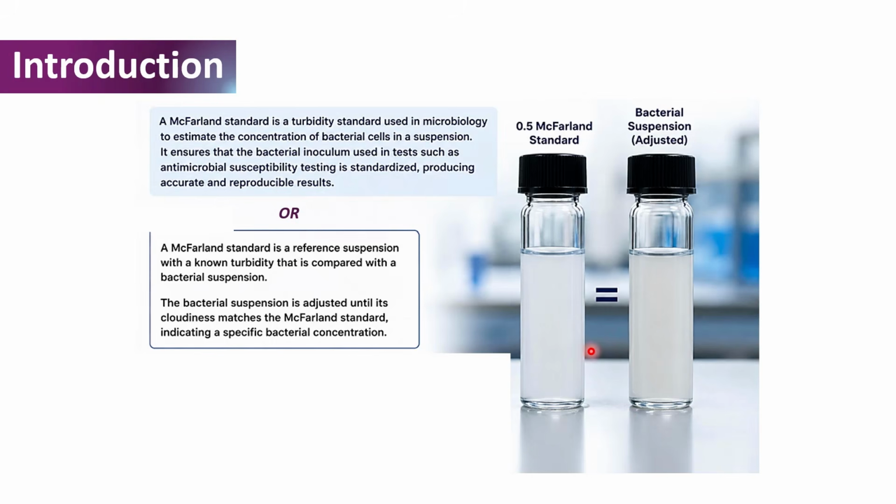So for this picture over here, and basically in antimicrobial susceptibility testing, we don't just use any McFarland standard but the 0.5 McFarland standard. And if you want to perform AST on our isolated organisms, we will have to adjust the bacterial suspension until its cloudiness matches the 0.5 McFarland standard over here before running our test.